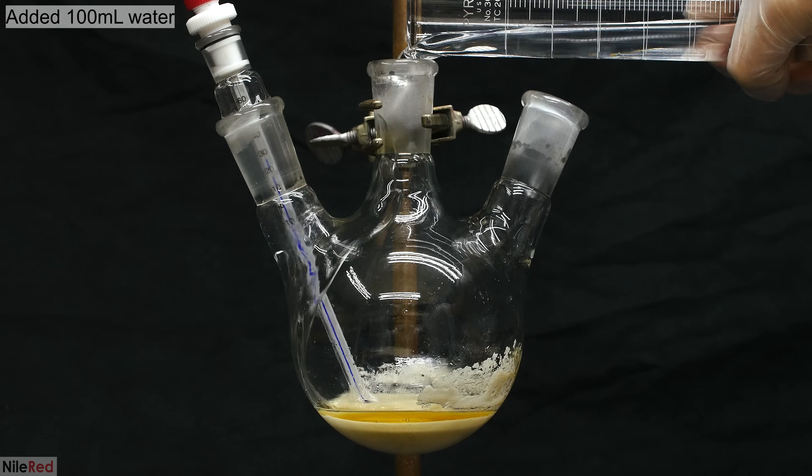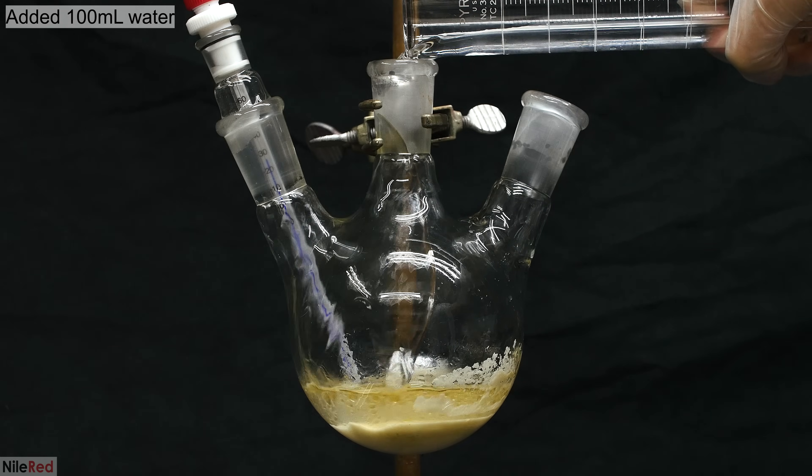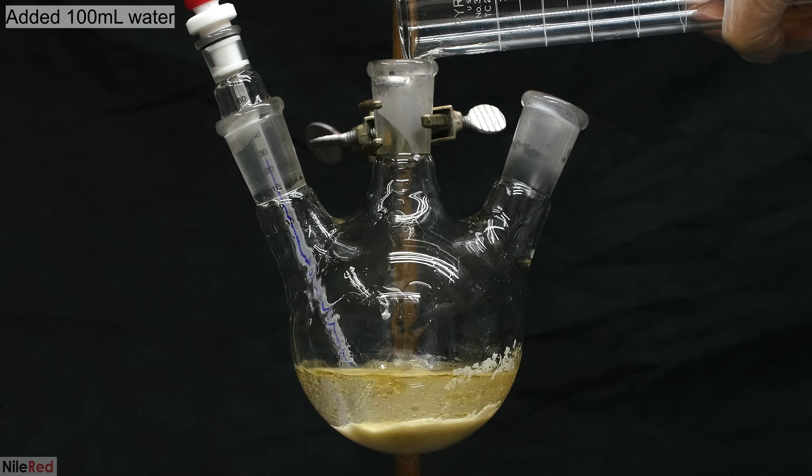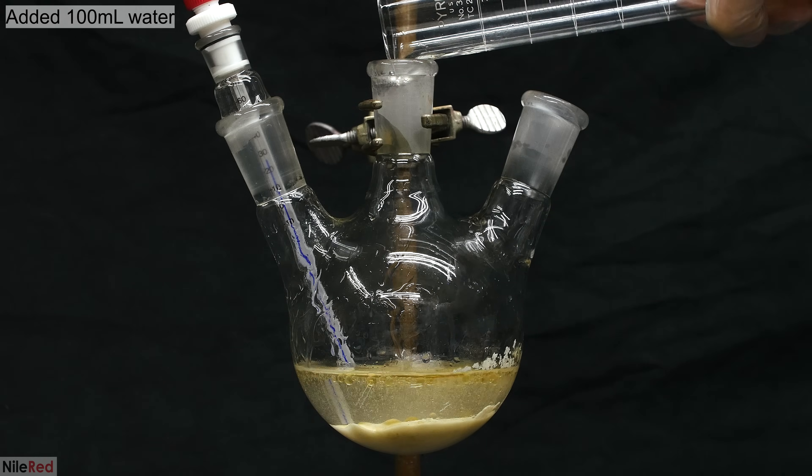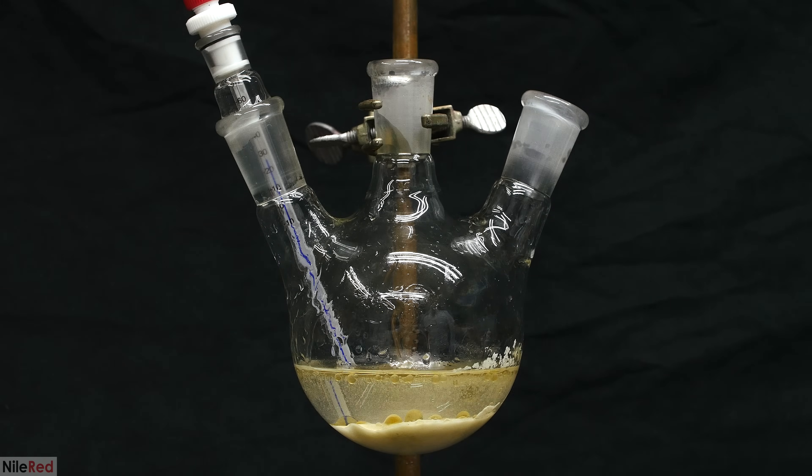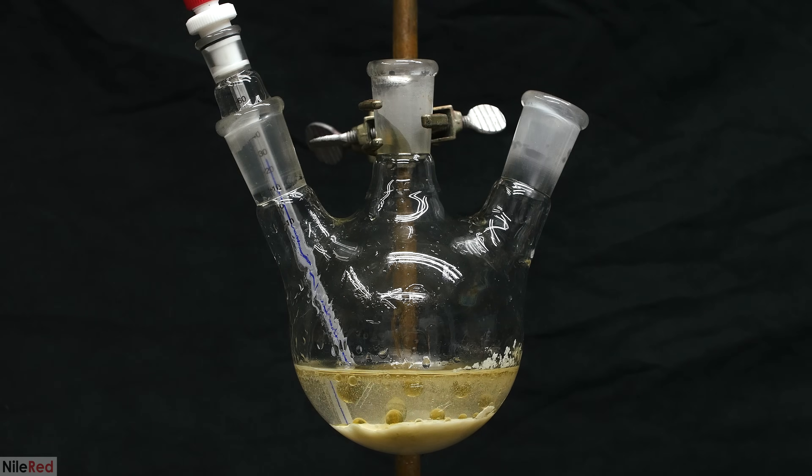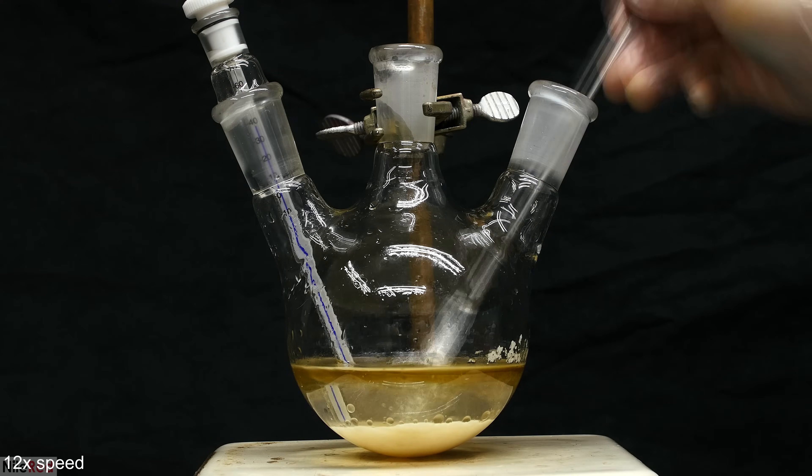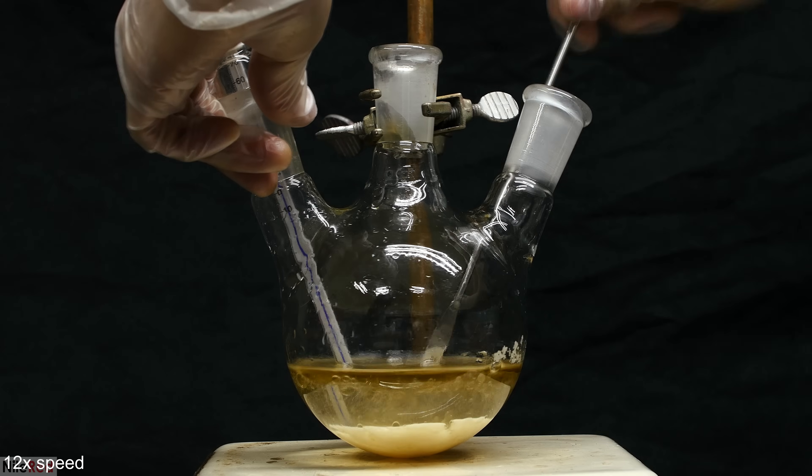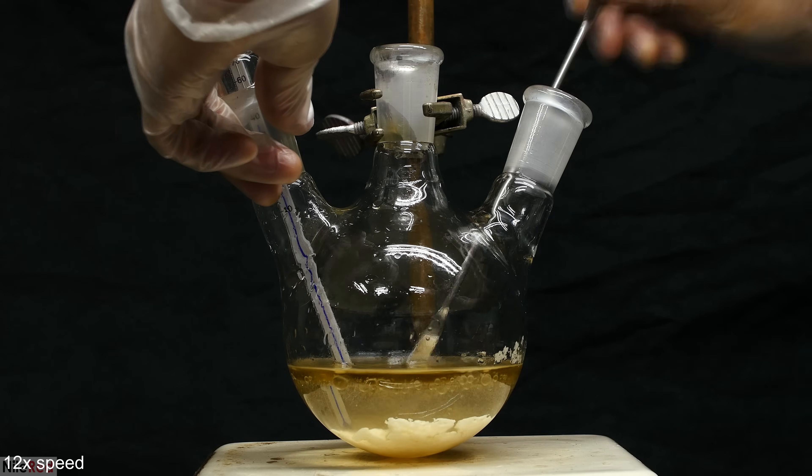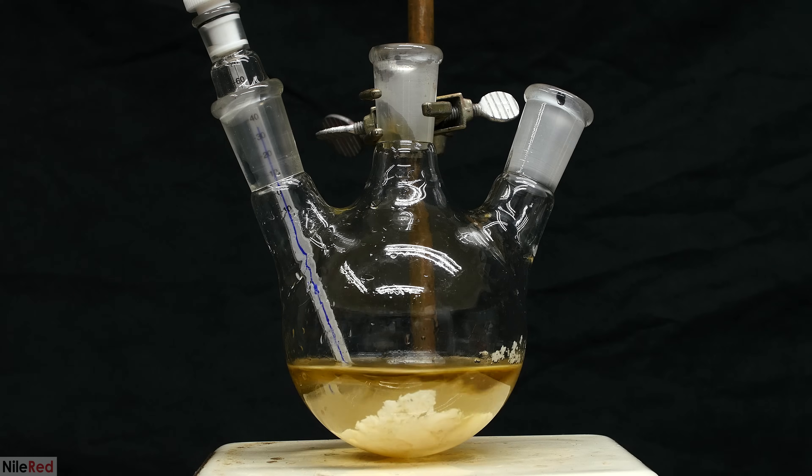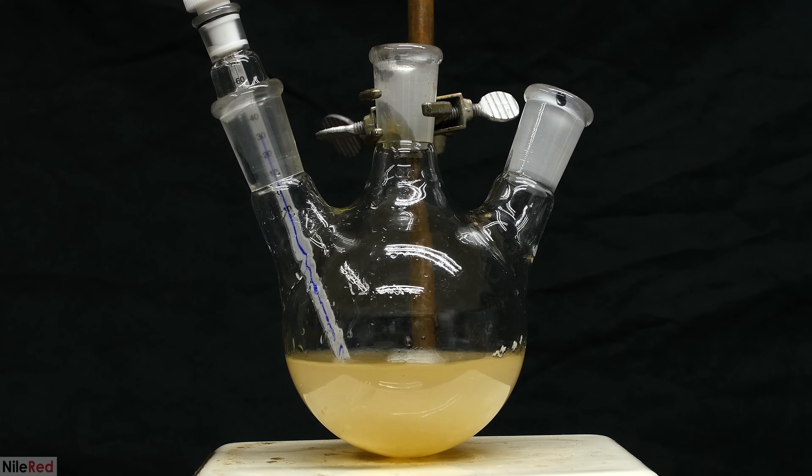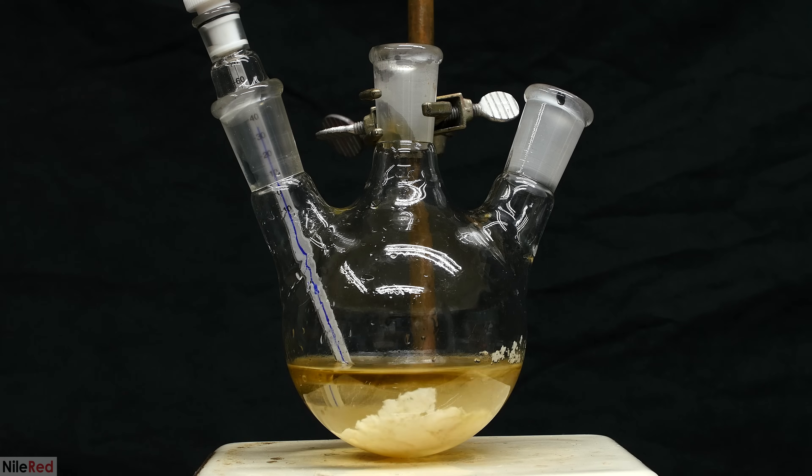I allowed it to cool down a little bit, and then I added 100 milliliters of water. The density of anisole is less than that of water, so as I add the water, you can see the anisole floating to the top. The salt at the bottom is pretty tough, so I use a metal spatula to break it up into pieces. Once I break up the cake at the bottom, my stir bar starts to work again, so I turn on the stirring and I let things mix until all of the salt has dissolved.